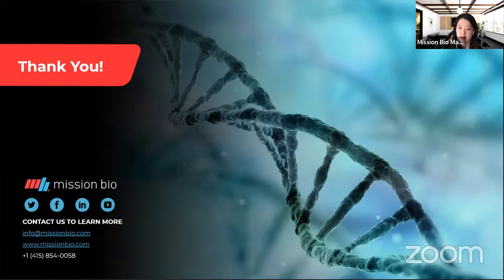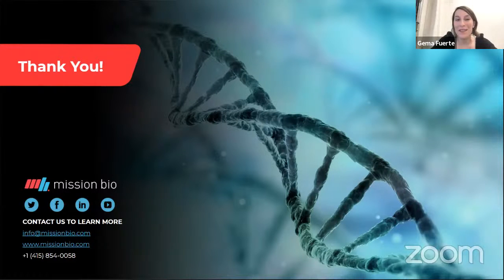Here's one. Is the Tapestri software free, or is it included in the platform? I'll take that one. Yes, it's free. You don't need to pay anything additional to analyze your samples. It is included in the price of the reagent. So you have access to all the software packages that Kelly talked about, Pipeline and Mosaic, as part of your assay. You don't have to pay additional.